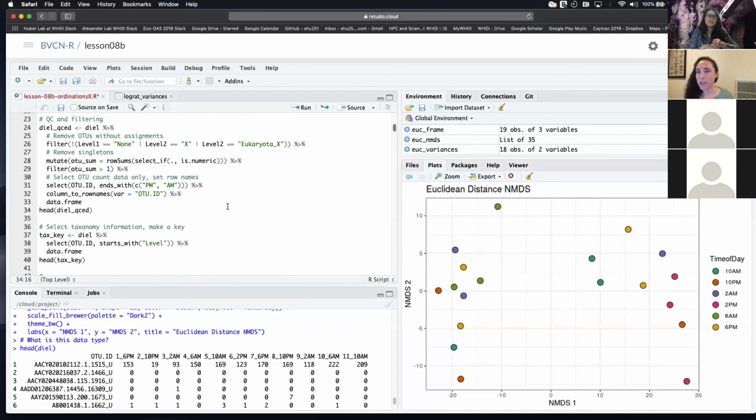Any more questions? I think the only other thing I wanted to ask and just confirm with you, Liz, or see what your experience is. The one thing that came up, and it was said a couple times on the R Slack channel, was rarefying or subsetting, or going to relative abundance before doing some of these transformations, and how that's falling out of fashion a little bit.